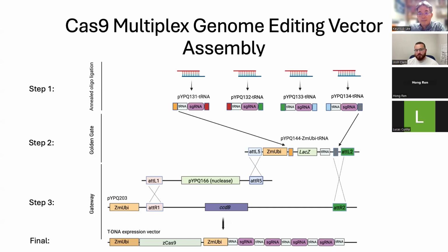Probably not ideal for secondary structure, but also for synthesis reasons. Sometimes if you're synthesizing guide RNAs with multiple copies of the same nucleotide in a string, you have some synthesis problems and you might not recognize it until later on.